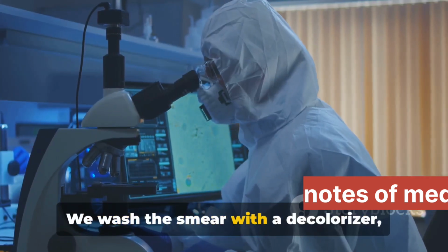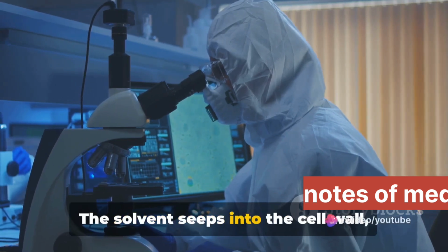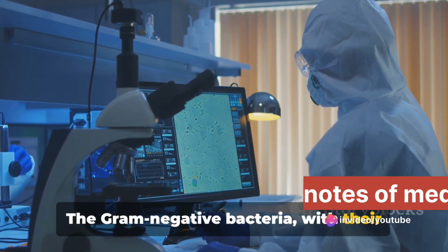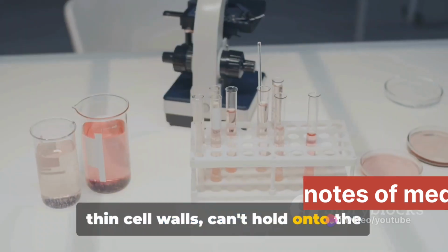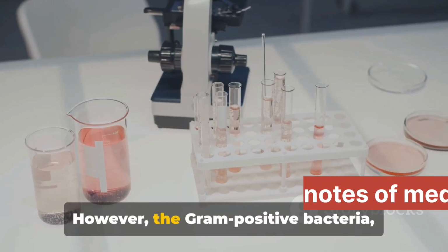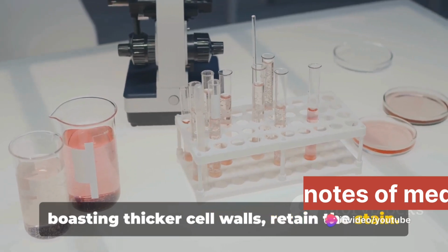We wash the smear with a decolorizer such as alcohol or acetone. The solvent seeps into the cell wall, disrupting its structure. The gram-negative bacteria, with their thin cell walls, can't hold on to the crystal violet iodine complex and get decolorized. However, the gram-positive bacteria, boasting thicker cell walls, retain the stain.